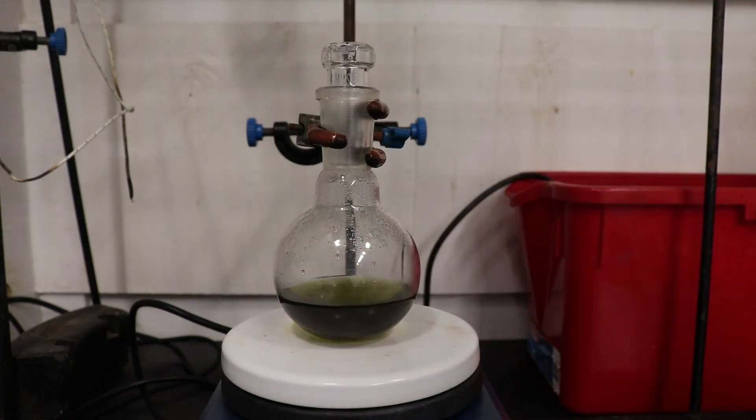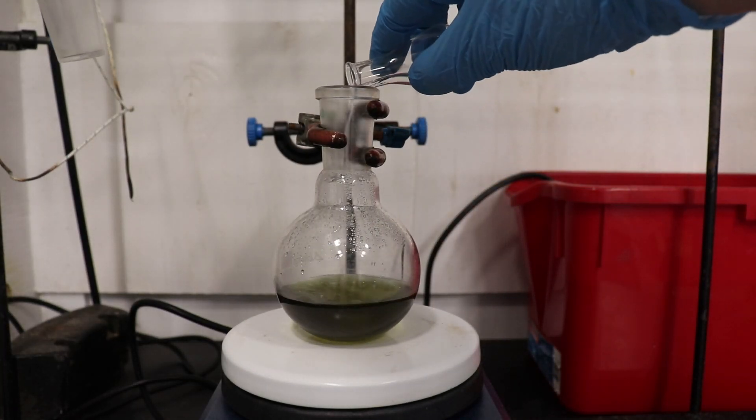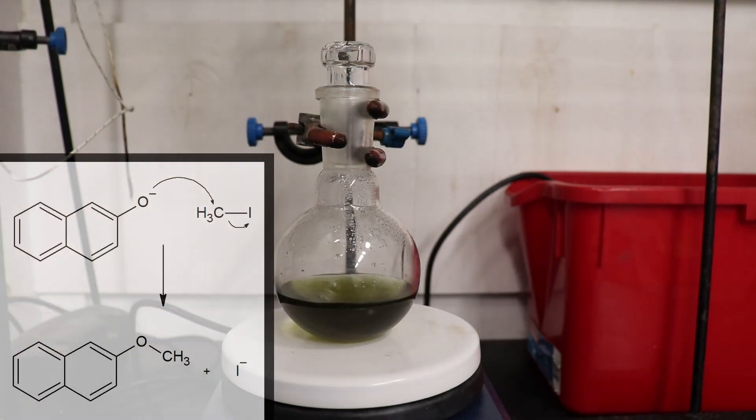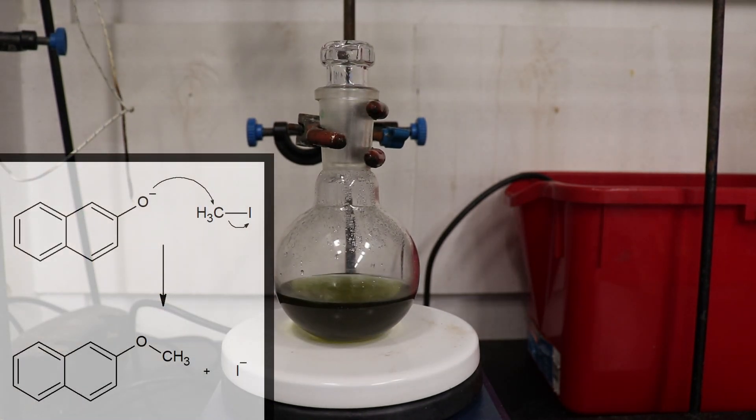Then 10 grams of methyl iodide is added into the flask. Then the flask is stoppered and allowed to stir at room temperature for 72 hours.